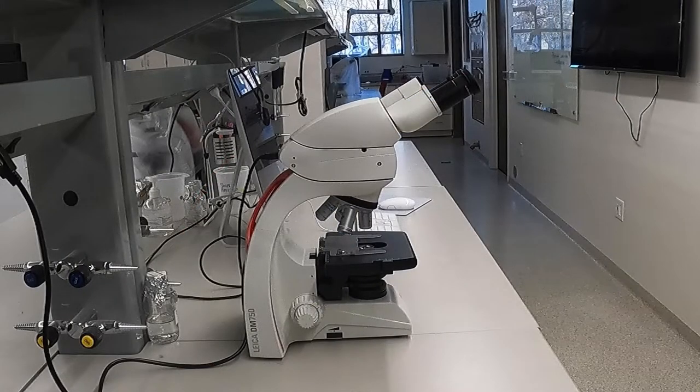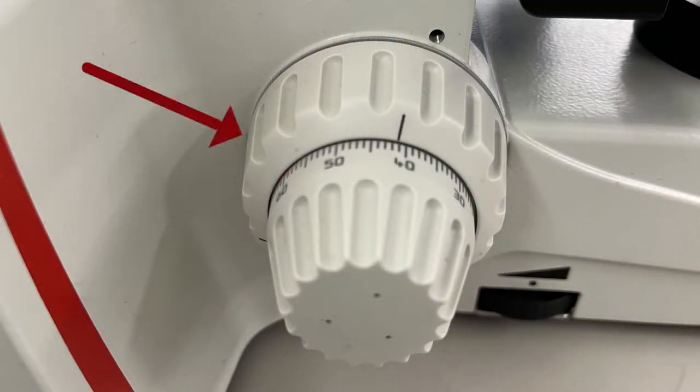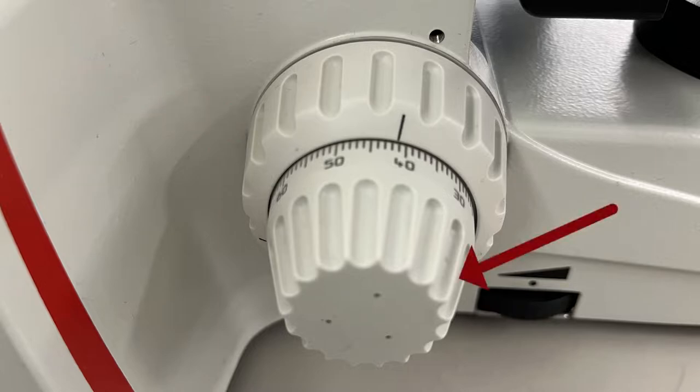On the microscope frame, you can see a set of two knobs. The larger one is the coarse focus knob and the smaller one is the fine focus knob.